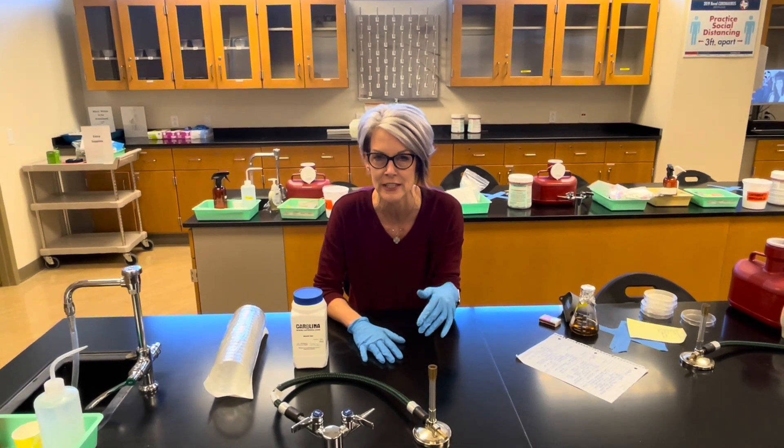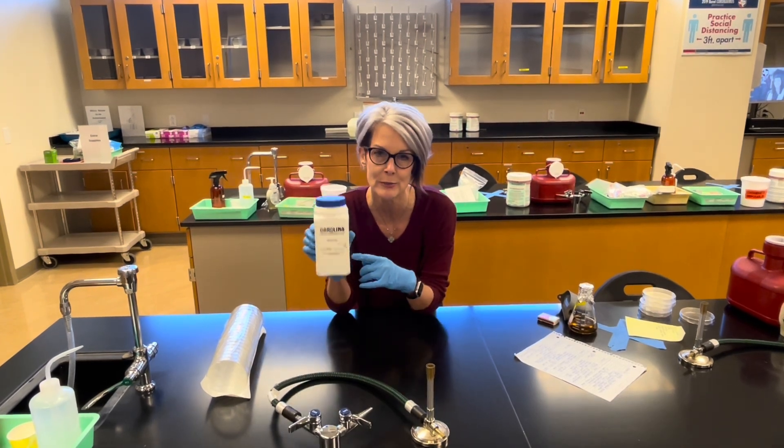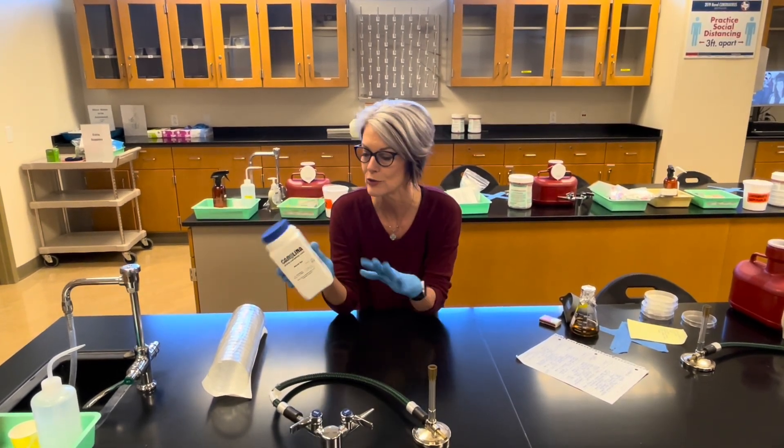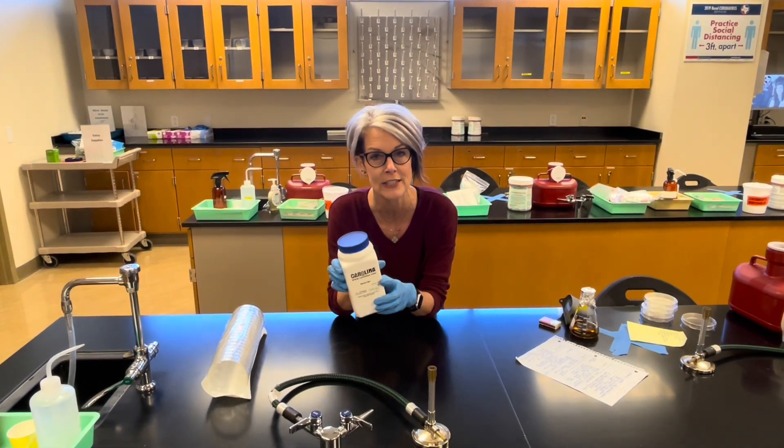You can get all the ingredients and measure them out separately. Or, what we do — because it's easier — is we buy a commercially prepared mix. You just follow the directions: weigh it out, mix it with water, and then autoclave it to sterilize it.